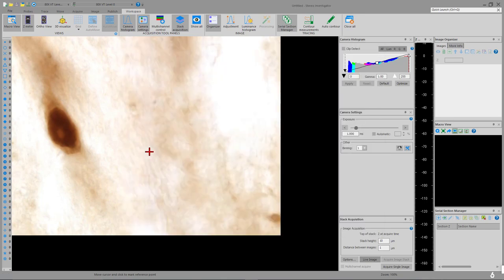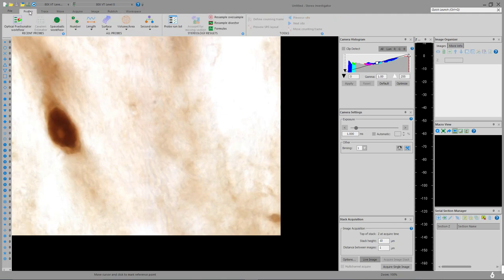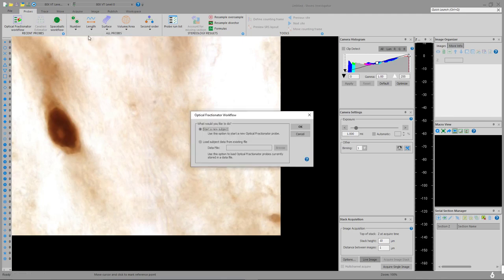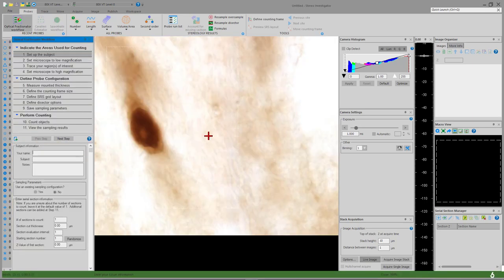Let's start up the optical fractionator. To launch it, go to the Probes tab and then, because we're trying to count, select Optical Fractionator Workflow. The optical fractionator workflow is like a wizard or guide that takes you through every step of the process and makes sure you're not forgetting anything important. To begin, select 'Start a new subject' and click OK. On the first step, we'll enter information about the subject — things like your name, the animal's number, or any notes. The most important thing on step one is the section information: enter the number of sections, the section's cut thickness (the block advance on your vibratome or microtome), and the section evaluation interval — which is a 1 in 12 series for this subject.